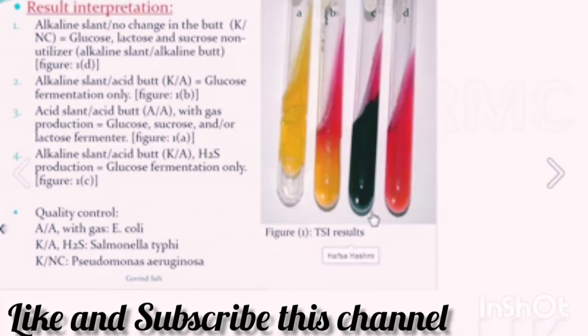In this one you can see that the butt is blackish in color and the slant has the same color. So in this case there is glucose fermentation only and there is H2S production. In this one you can see that there is alkaline slant and the butt is yellowish in color, so it is acidic. This shows glucose fermentation but without H2S production.